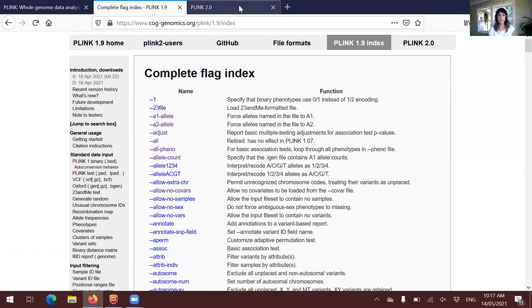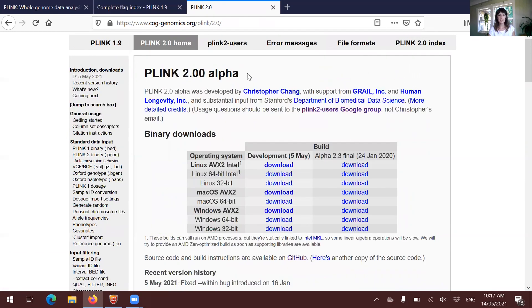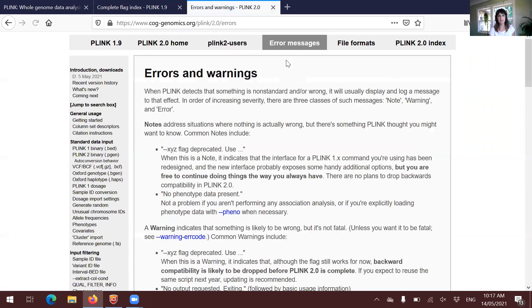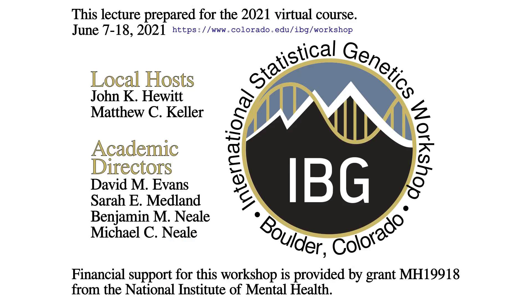The PLINK 2.0 website is similar. You will have, again, here and here. Both include a menu with error messages. And this is it. Just an introduction to PLINK.